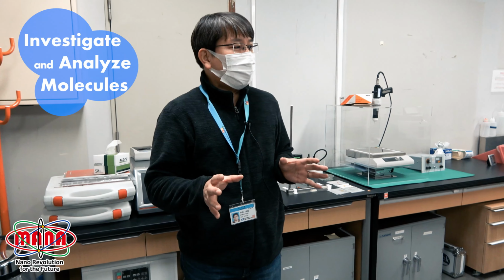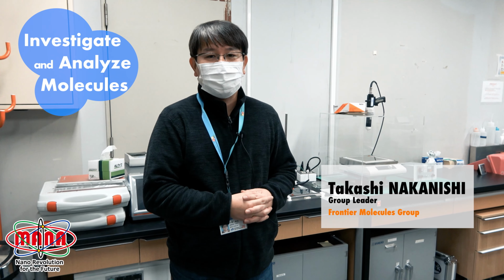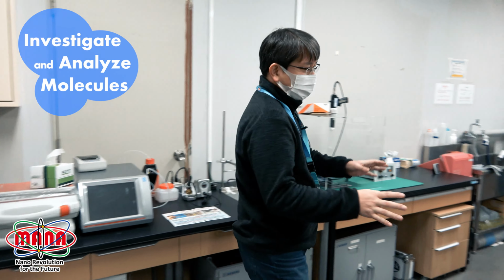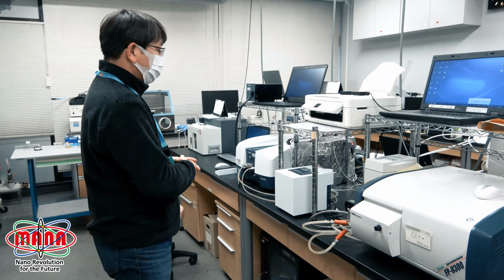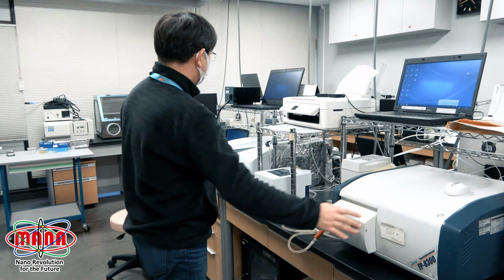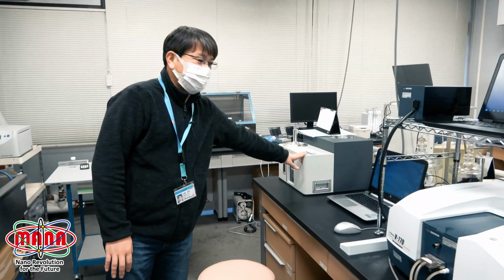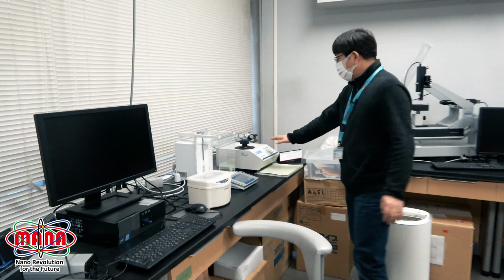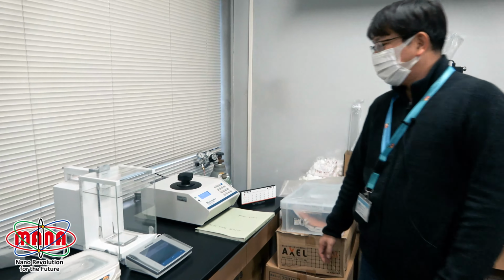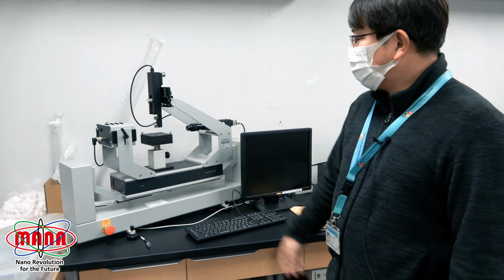In this room, we have several instruments to analyze the molecules we synthesized. In this section, we have several spectroscopy instruments: fluorescence, UV-vis absorption, and also a fluorescence quantum yield instrument. And here we have a density measurement instrument and a contact angle instrument.